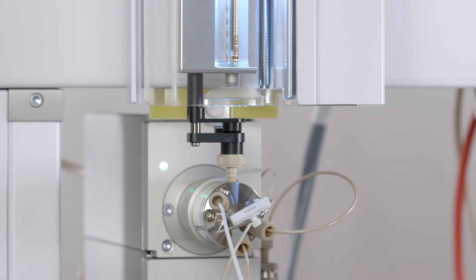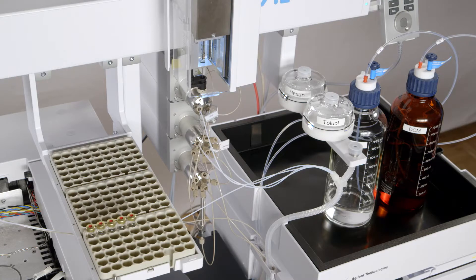The workstation may be equipped with a single quad. For highest possible sensitivity, we recommend a triple quad.